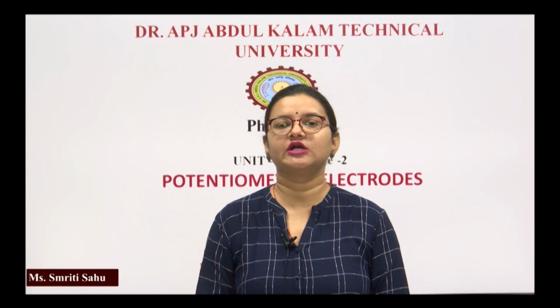Welcome to the topic potentiometric electrodes. As in our previous lecture, we saw what potentiometry is and how it works, what the principle behind it is, how a potentiometer works, and how the endpoint is to be determined or the analytical concentration is to be determined in a potentiometric technique.